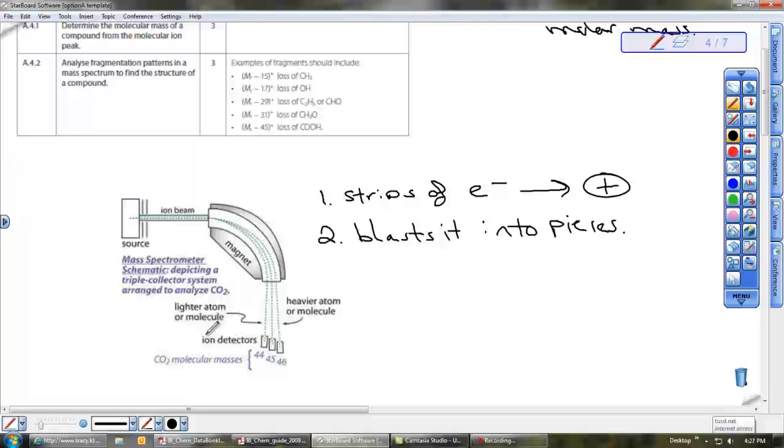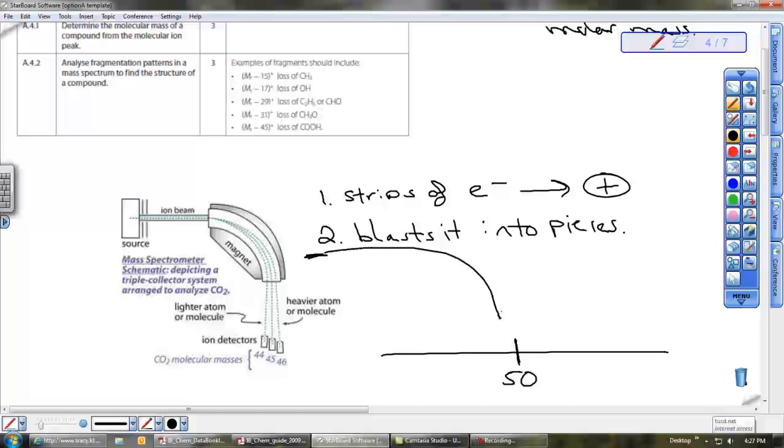So, in other words, imagine this was the detector, and it's calibrated so that this mark, I'm making these numbers up, but let's say that it's calibrated that things that have a molar mass of 50 AMU strike here. And the source is over here, so think of the curve this way. If they strike here, or here, or here, it's calibrated to say, okay, this one's 49, this one is 48, and so on. And further this way would be masses greater than 50. Does that make sense?